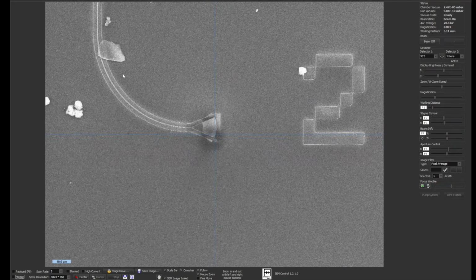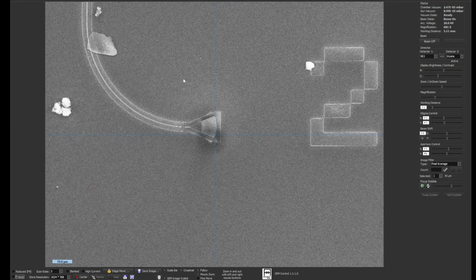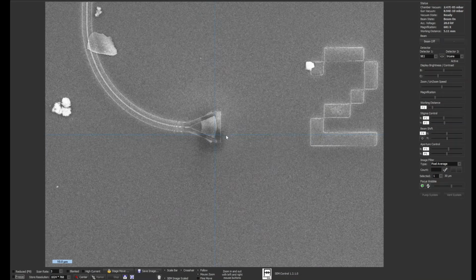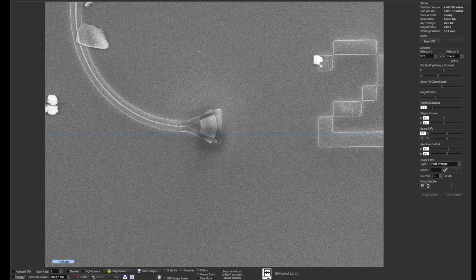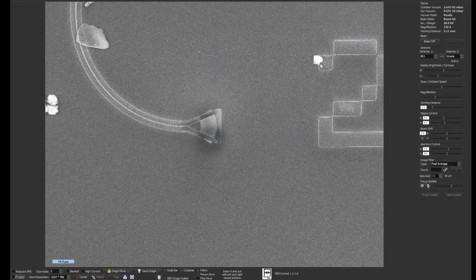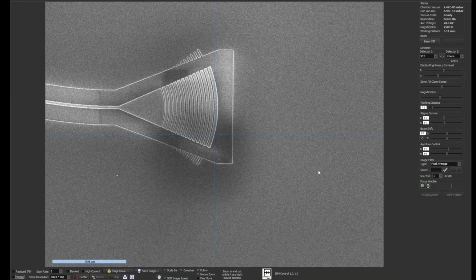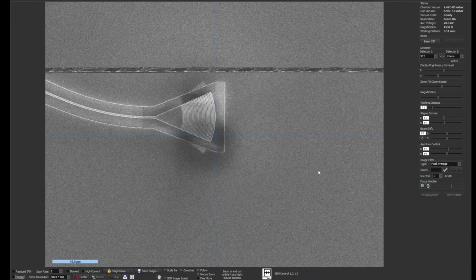Okay, that's clear. We have so much debris lying around here that the position recognition was not as precise as usual because of this stuff lying around here. This was causing an additional deviation. So that shouldn't be confused, or one would expect that, I would say.